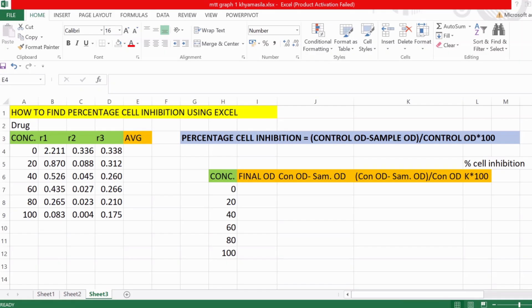Hello everyone, so today we are going to learn about percentage cell inhibition and how to find percentage cell inhibition using Excel. Before starting, we need to know what percentage cell inhibition is.